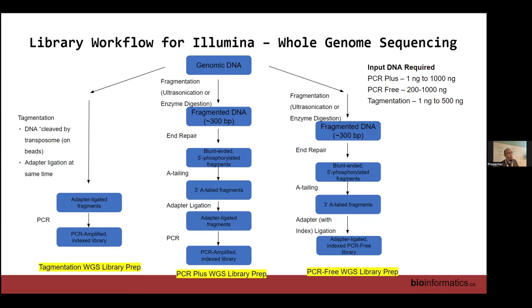In any method, you will do that. But also, like I said, you may be sequencing the same part of the genome, the same copy of the genome. We'll come back later to a method that can help mitigate that, for example adding what we call a unique molecular barcode, or UMI, so that we can look at how efficient the ligation is, because ligation is definitely not the most efficient chemistry. So every kit is trying to improve that over time.